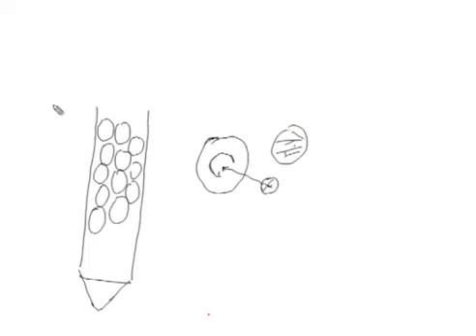So, what happens then? The larger molecules will not be able to spend time inside; they will only spend time in the interstitial spaces, the space surrounding this stationary support material in which the stationary phase is contained.